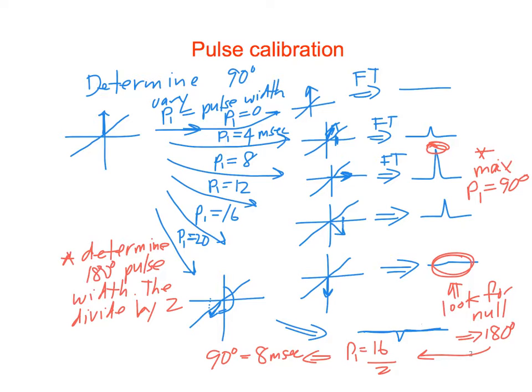I think what you can do is get one spectrum, say if you start going from this short, you wouldn't really start with 0, right? And you know that some short pulse width should give a positive peak. And so you'd phase that positive and then try to use the same phasing for the rest of the experiments.